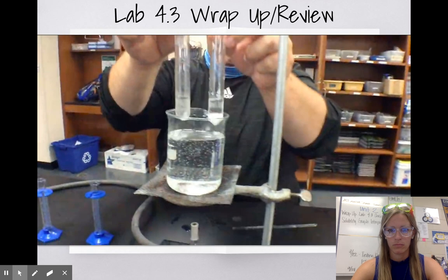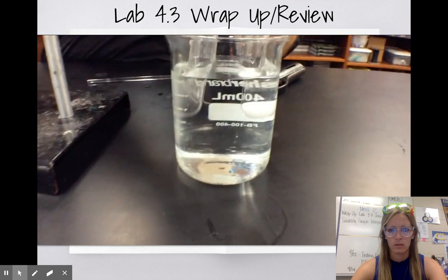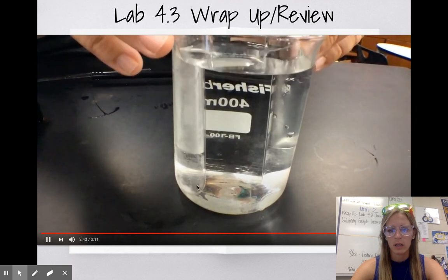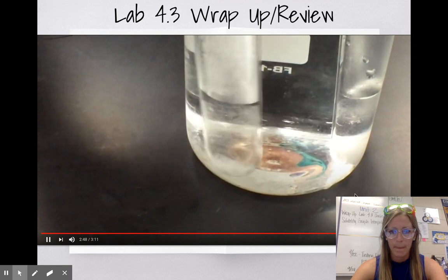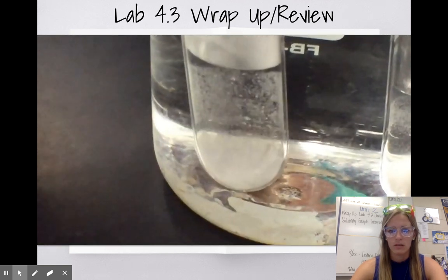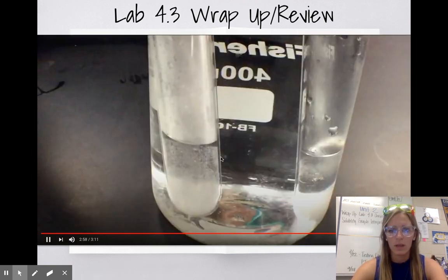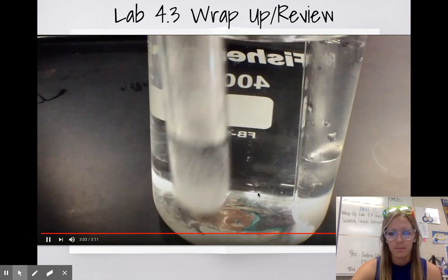Now we're going to make observations. Keep an eye on this test tube here and look at what is occurring on the bottom. You should be seeing crystals precipitating out of solution. They were once dissolved and now they're coming out of solution.